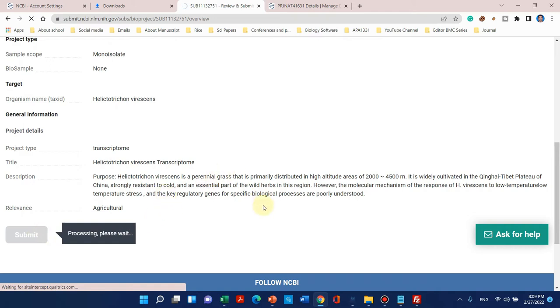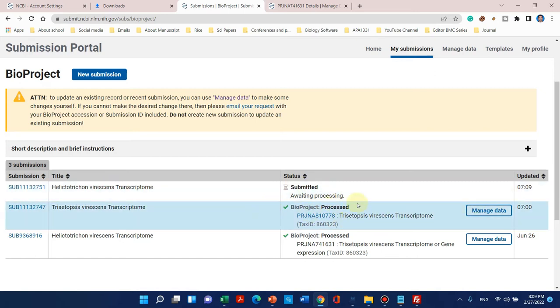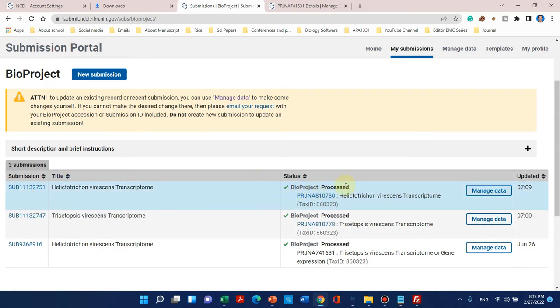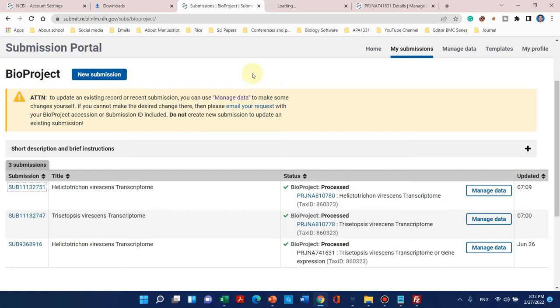When you click submit, it will take a few minutes to process. We can see it is submitted and awaiting processing. After processing, we can see the BioProject is already processed — just after two minutes it is assigned a submission ID. This is just a BioProject ID, not your accession ID. Please do not use this ID in your paper as an accession ID.